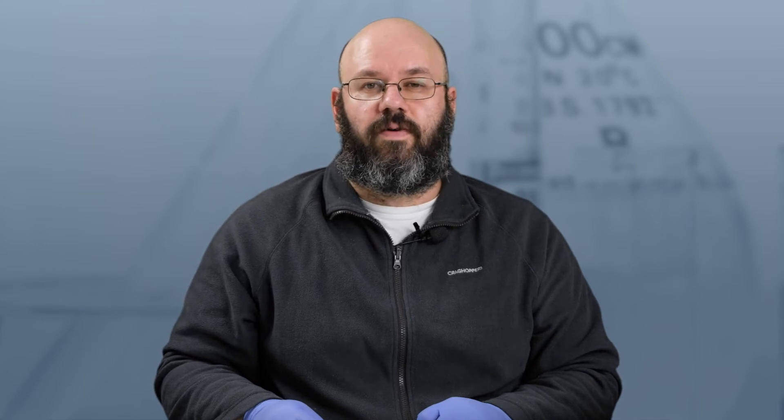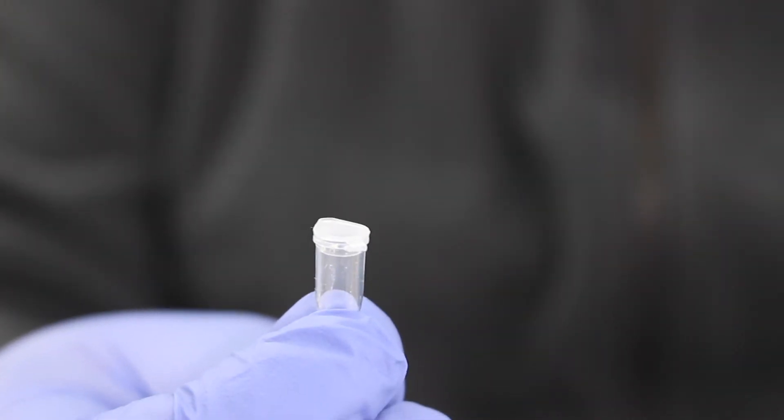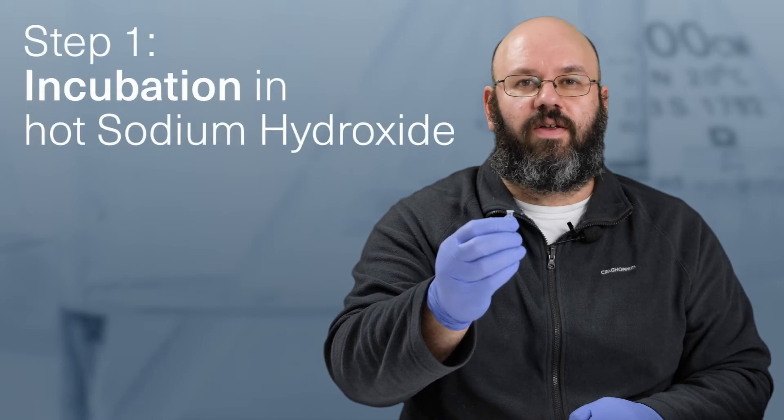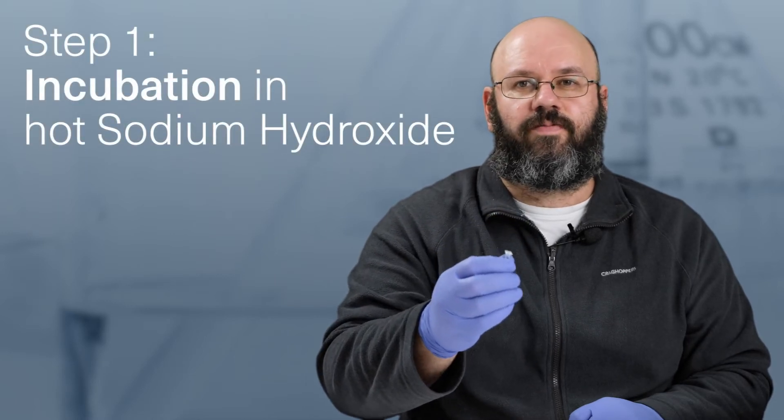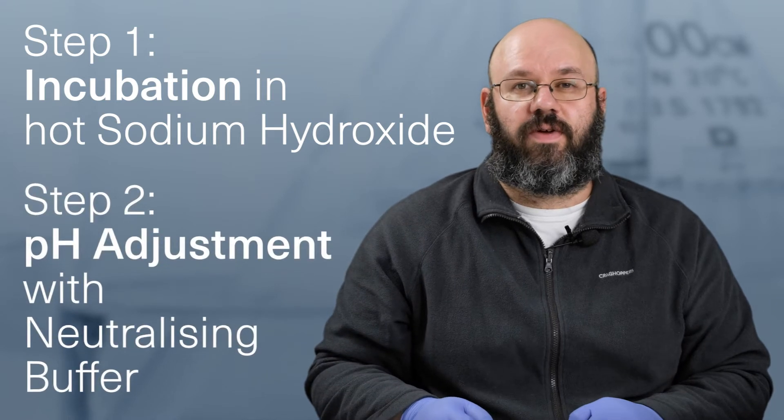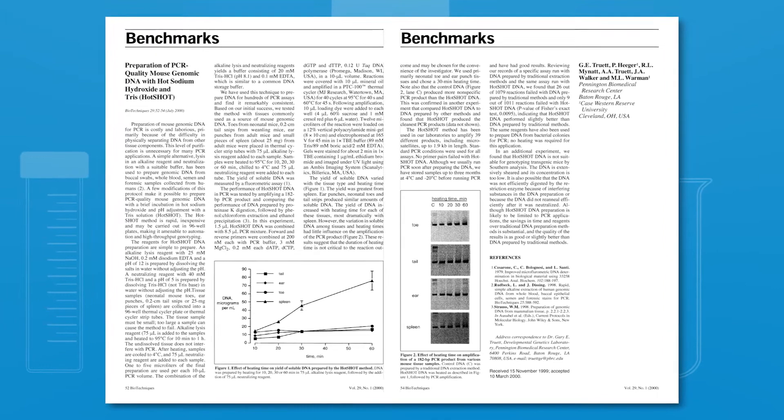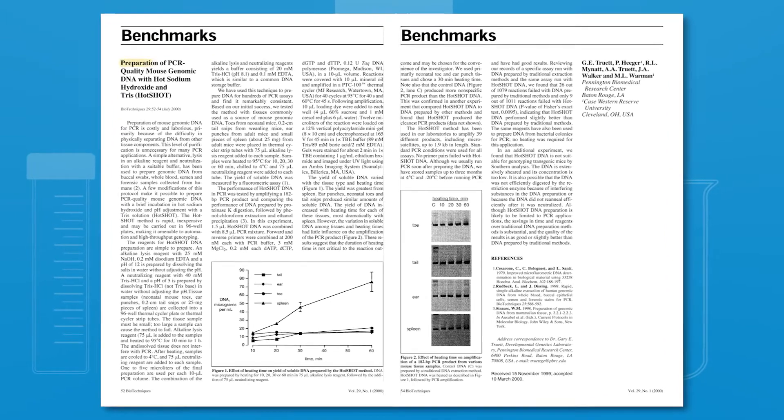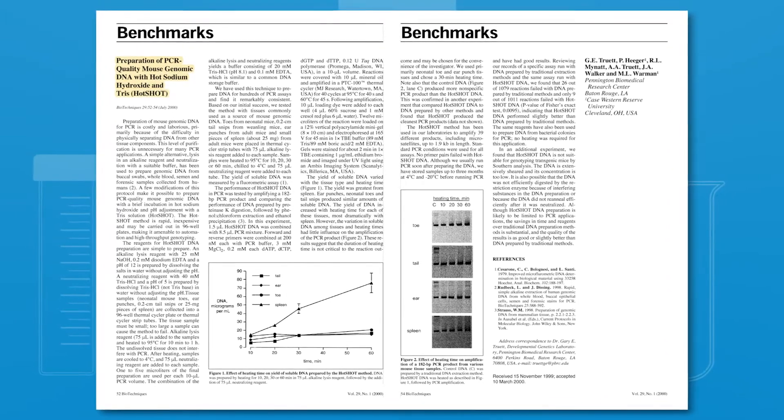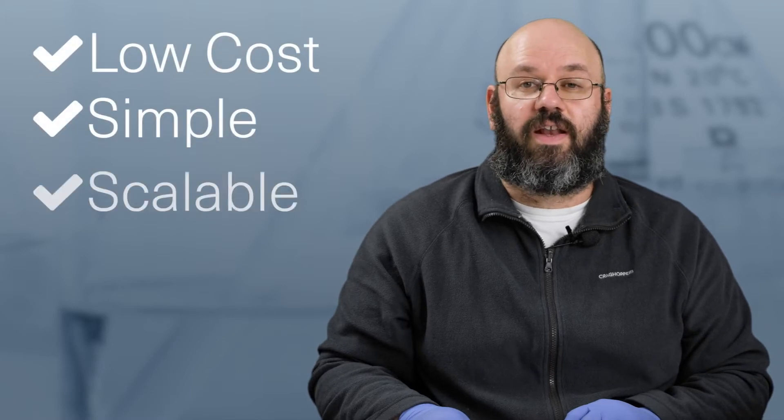The Hotshot method is a simple two-step protocol performed in a single PCR tube. The first step is an incubation step in hot dilute sodium hydroxide, followed by pH adjustment with a neutralizing buffer. The protocol was originally developed in 2000 by Dr. Gary Truett and his team for routine genotyping of mouse tissues. Today, it's widely used in many different applications because of its low cost, simplicity and scalability.